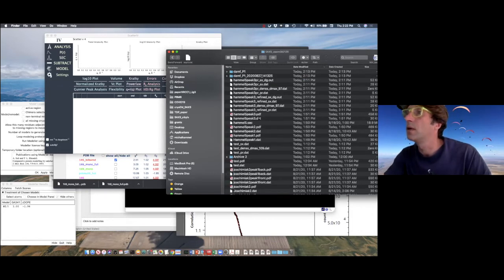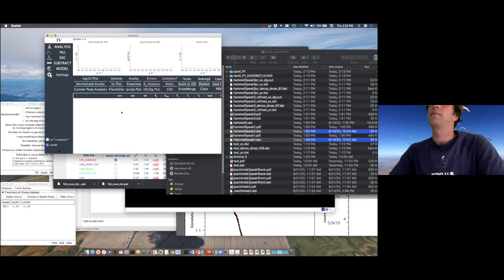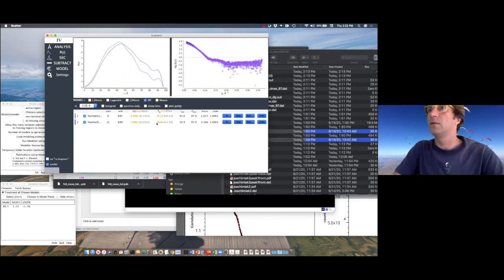Peak 1 and peak 2 right here. Okay. I apologize, the color is going to be different. I'm going to extend the colors. So we see the dark blue. Okay, so in this case, it allowed me to take the entire curves.